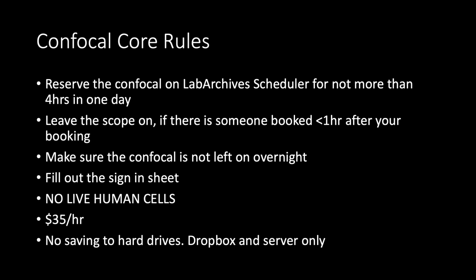Lastly, I'll go over the confocal rules. We don't allow people to use the confocal for more than 4 hours in one day. If you need to image for longer than 4 hours, we ask that you do the additional hours outside of the normal 9 to 5 working day. This is to allow everyone in the department, or all of the users, to have equal access to the confocal. If there's someone booked less than 1 hour after you, make sure you leave the microscope on.